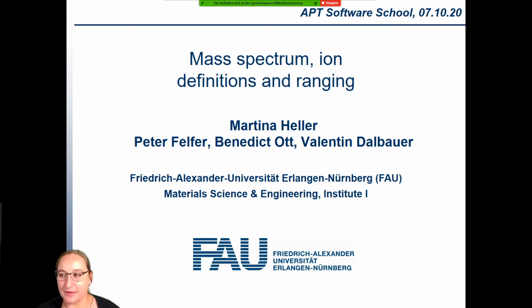First of all, I will give you a really short presentation with a PowerPoint, what we are going to do in the next 1.5 hours, just to get a quick overview of what fundamental steps we are going to do.